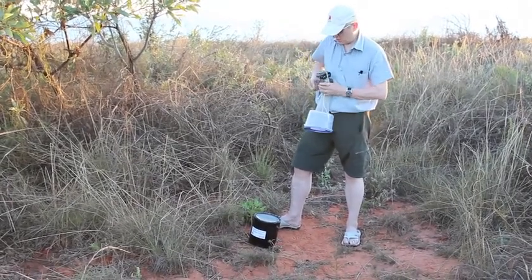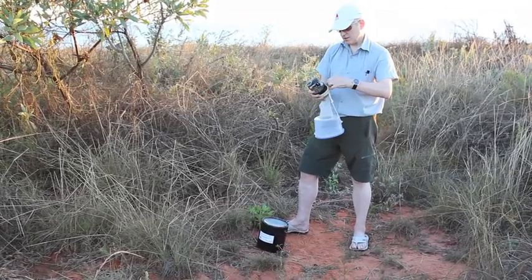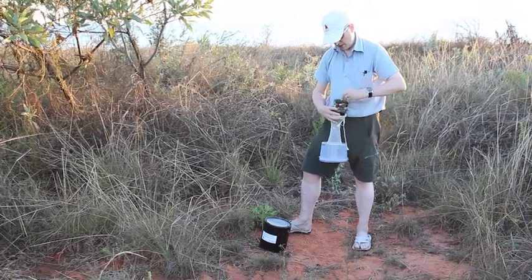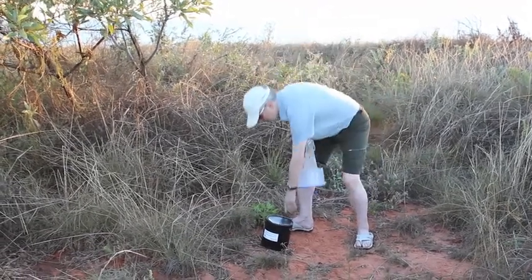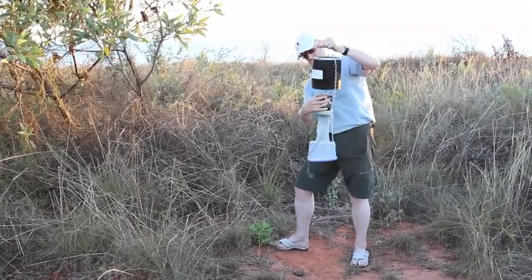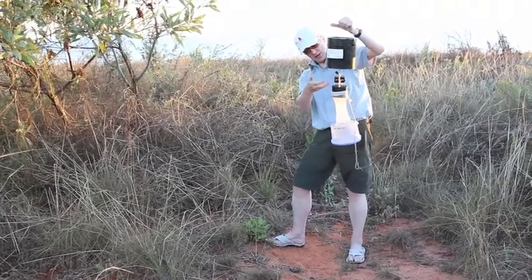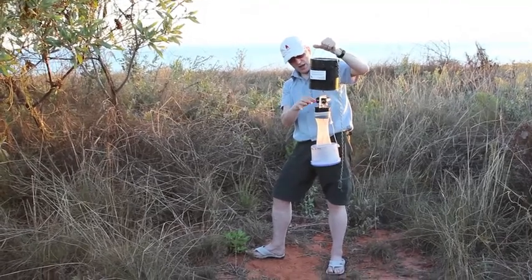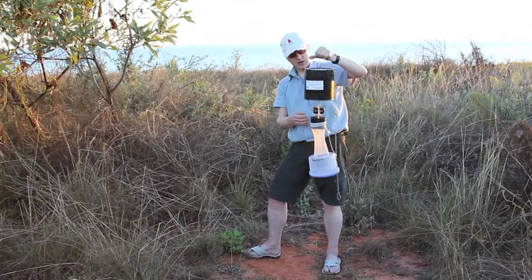We're absolutely sure it stays together and we've got something to keep those mozzies in the trap when we're finished. I've put a rubber band on, and the fan sits underneath this tin can that's got dry ice in it. So the fan is going to draw carbon dioxide down here, which will attract the mosquitoes — they'll fly in and be drawn by the fan into the trap and won't be able to get out again.